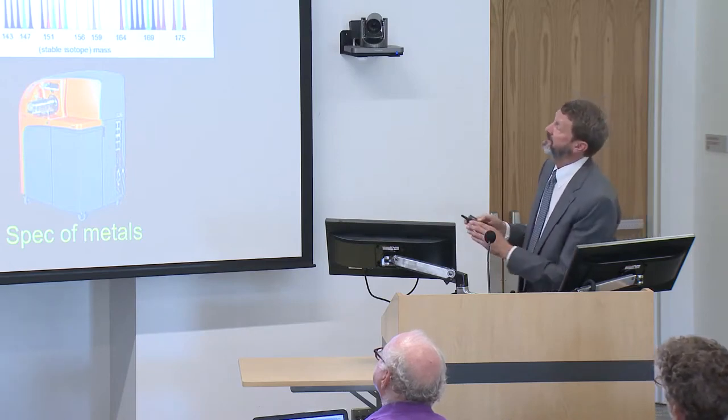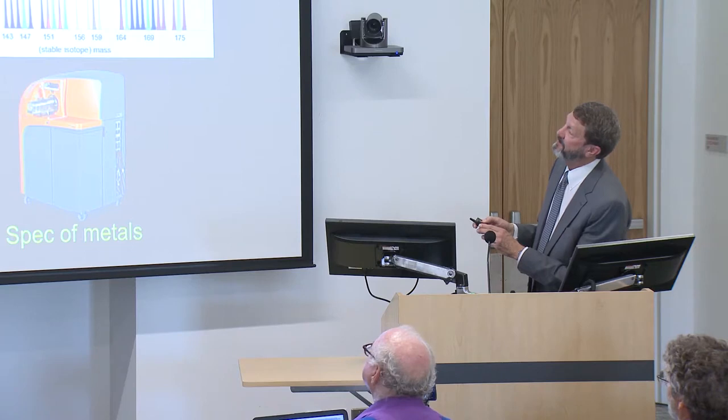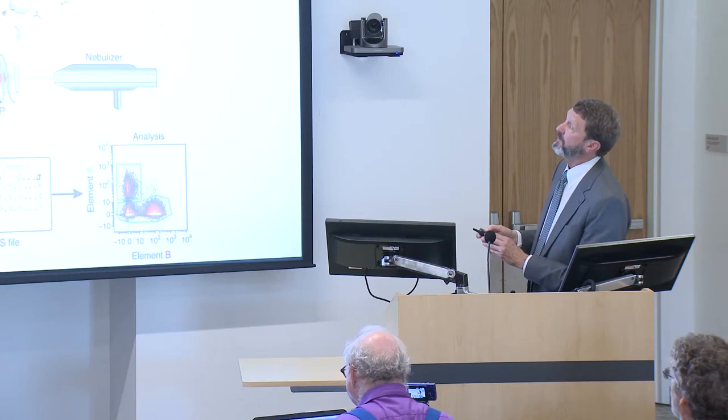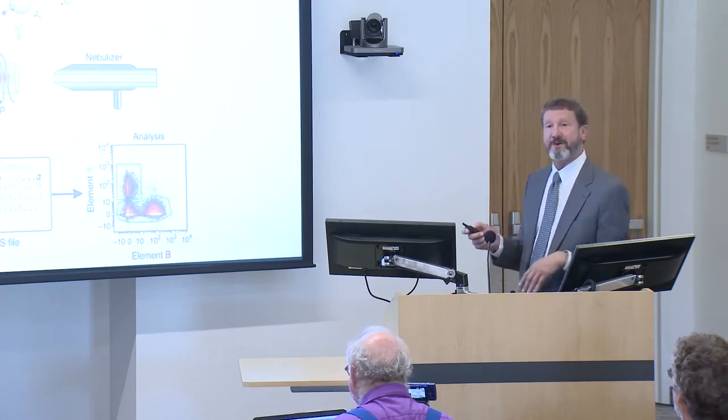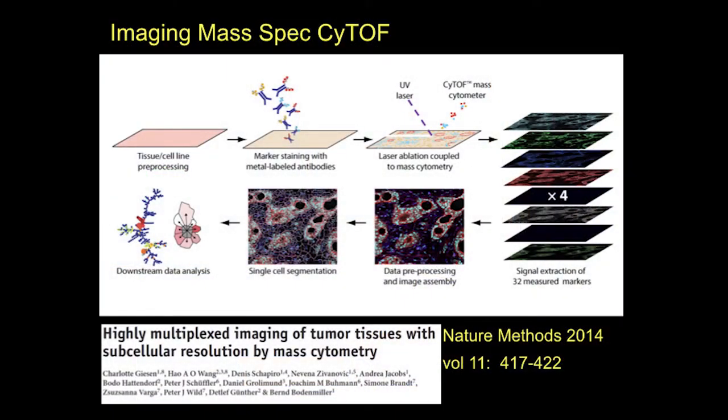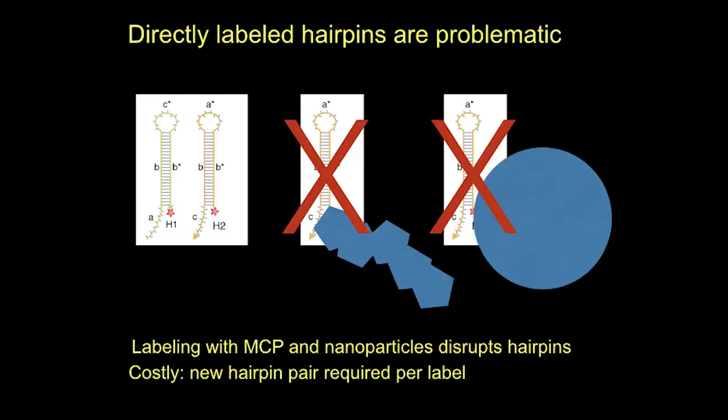Okay, we're also one of the test sites for the CyTOF. And we've been, of course, wanting to carry the multiplex imaging all the way to that. One of our problems, well, I think everybody here knows the story of the CyTOF and using metal dyes instead of using fluorochromes, both in a flow approach and in an imaging approach by cutting divots out of the specimen and having those be analyzed. Now, the beauty of that is that it lets you do 36-plex, but I've already told you that we're up to 200-plex with the Muse and HCR, so maybe it's a problem or maybe it's a way of going.